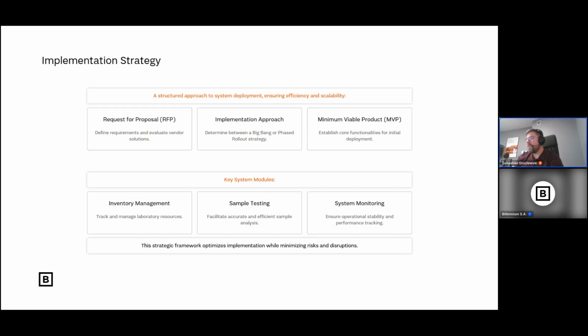The next thing about the software that is kind of obvious at the beginning is that some LES systems, some LIMS systems, come with interfaces built in. For example, there are systems that can communicate out of the box with, let's say, LabX, Labware, or other giant systems. You don't have to create an interface anymore if that interface fits your needs, because that may also be a problem: an out of the box interface provided by the vendor is just not right for you.